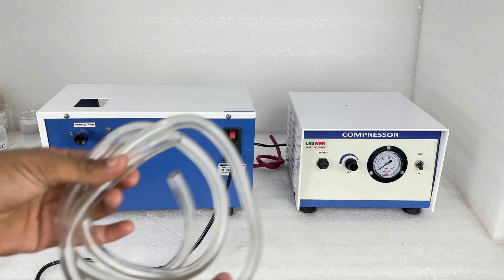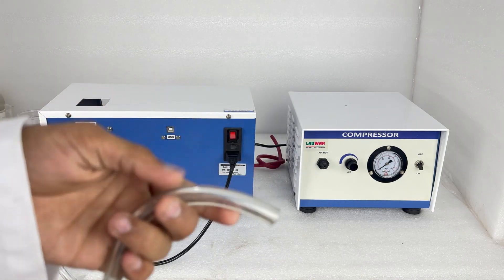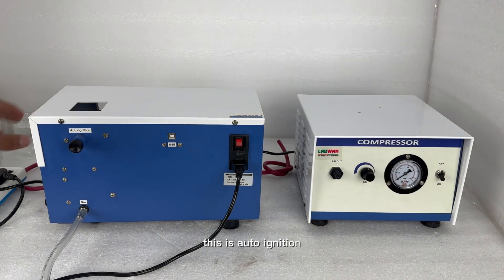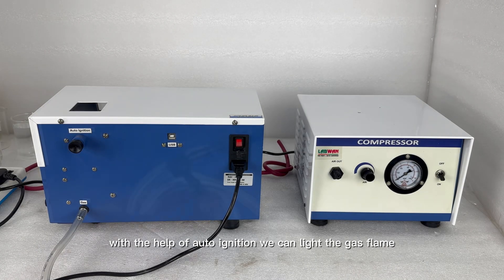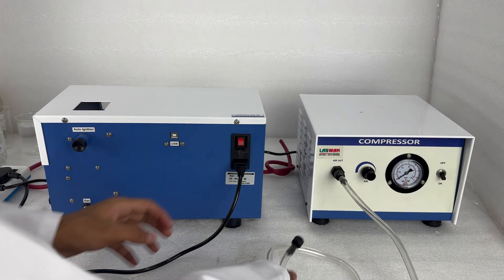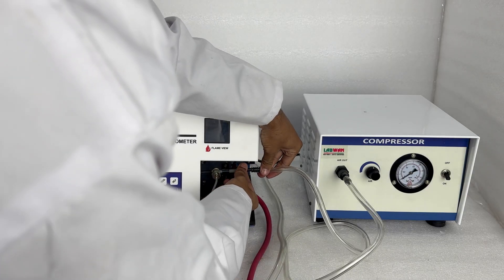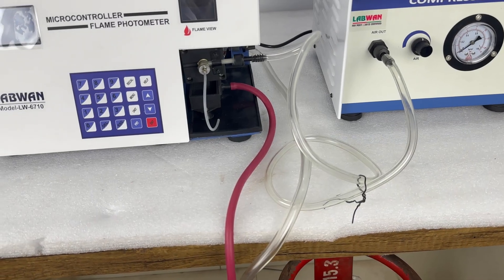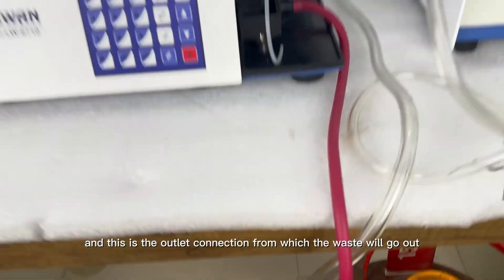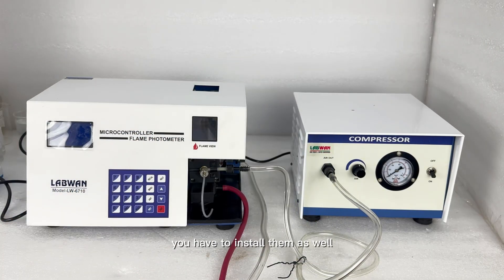Now we will make the gas connection — do the same as I am doing. This is the auto-ignition; with the help of auto-ignition we can light the gas flame. Now we will make the compressor connections. This is our gas connection, and this is the outlet connection from which the waste will go out. These are the chimneys of our flame photometer — you have to install them as well.